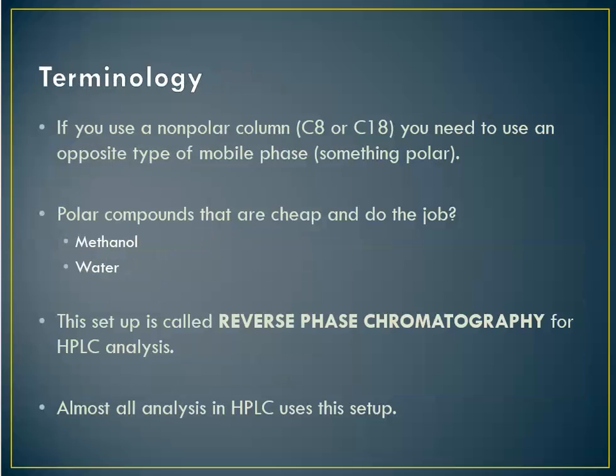Okay, so that really ends the whole theory part of the HPLC instrument. So in the next set of videos, what you will see is us focusing on the pieces and parts and what makes this machine up. So terminology: polar, nonpolar, stationary phase, mobile phase, elution, right? C8 and C18 columns, methanol, acetonitrile, all of these are brand new terms maybe that you have never used before. So there's quite a bit of different definitions and quite a bit of stuff that you've learned hopefully throughout this theory portion of the HPLC instrument.